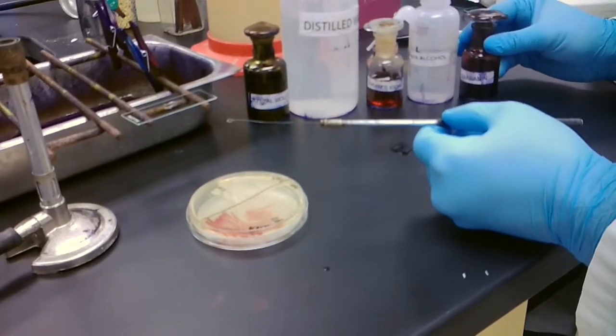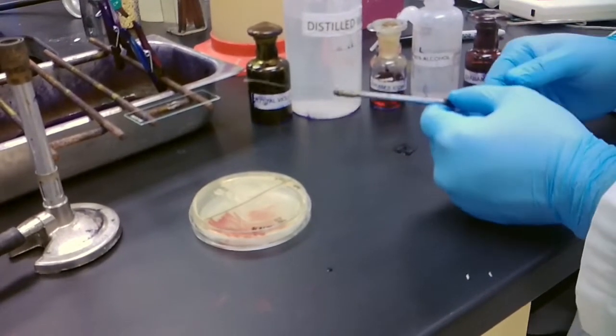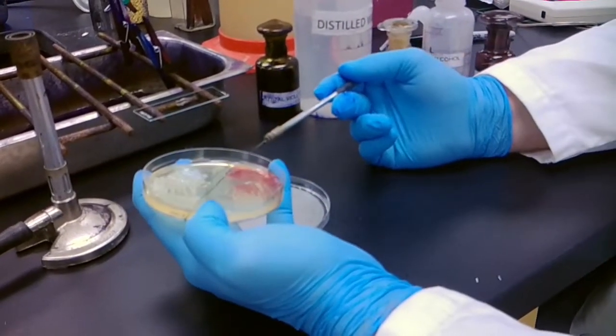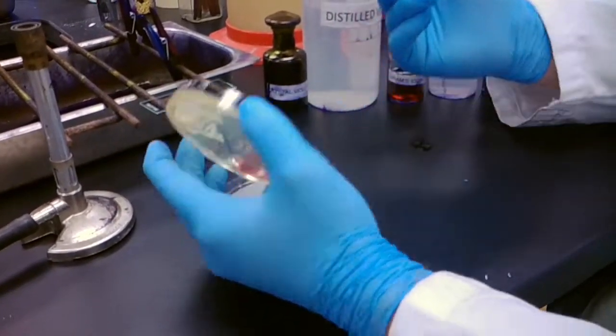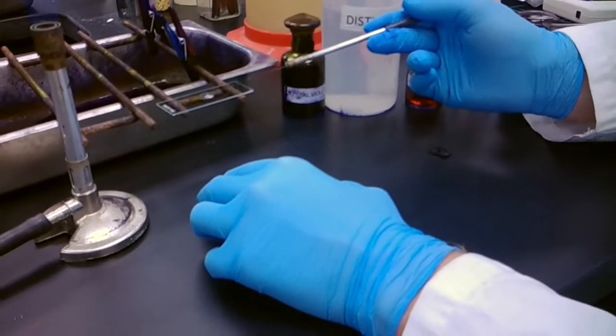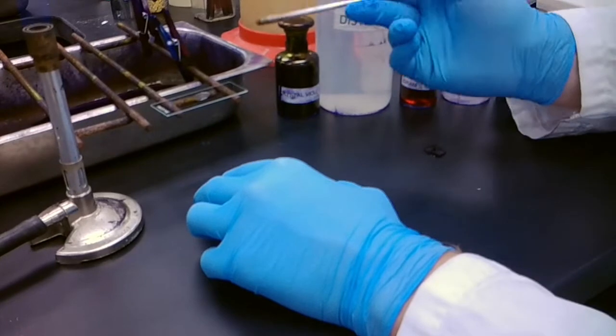So in order of adding things, first we take our bacteria. Here we'll use some E. coli. I'm just going to take a small amount and then mix it around on my slide.